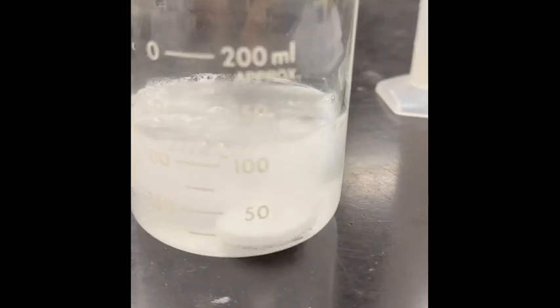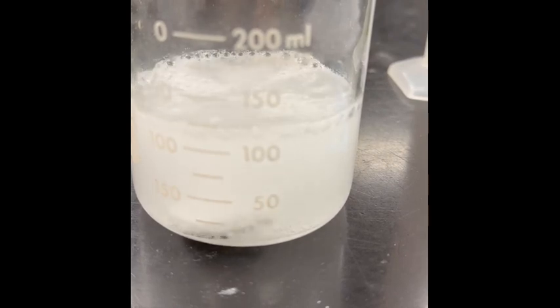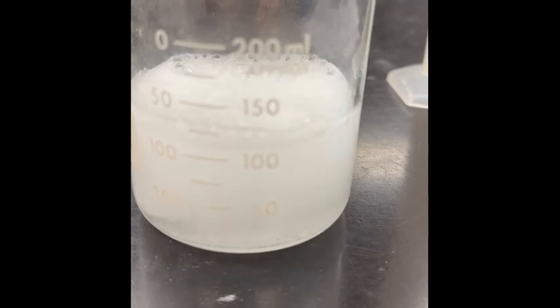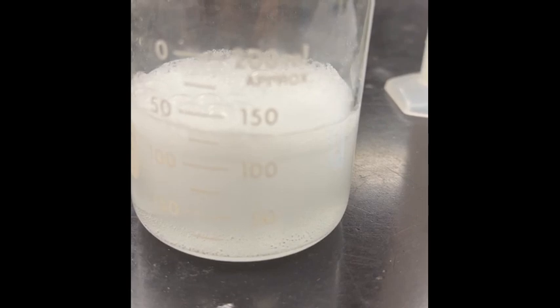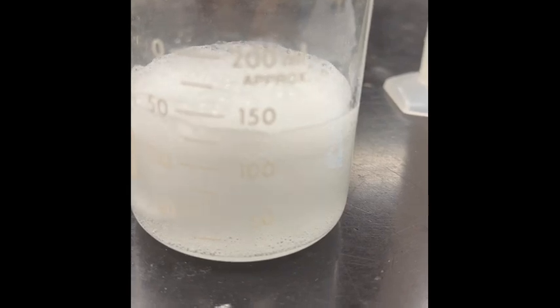Next, I'm going to add the Alka-Seltzer tablets to the water, and we're going to see the liberation of carbon dioxide gas. You've got the balanced equation for this on your lab sheet, where 3 moles of baking soda, so sodium bicarbonate, react with citric acid, and in the process you get sodium citrate, 3 moles of carbon dioxide, and 3 moles of water.